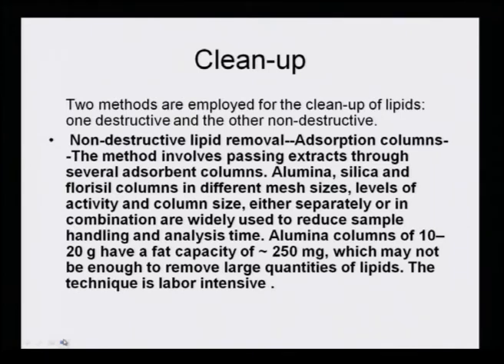The technique is labor intensive. That means, if there are large amounts of fat or lipids that need to be removed, one has to use bigger columns and more columns. Destructive lipid removal is the second option.